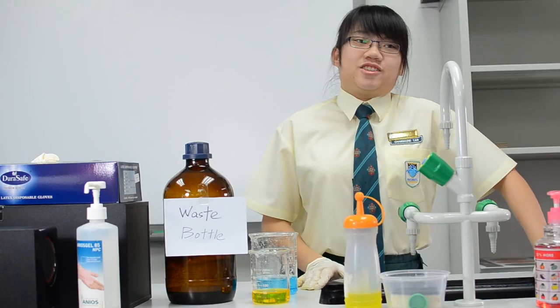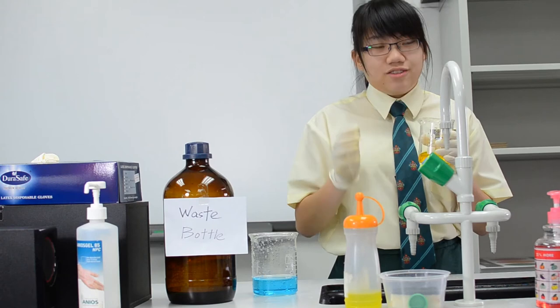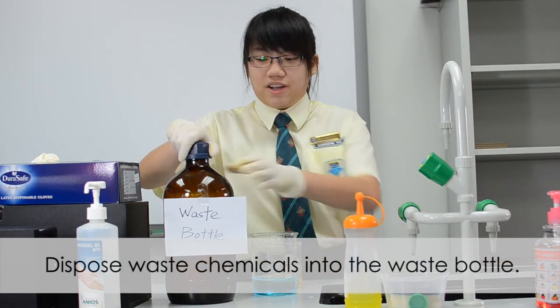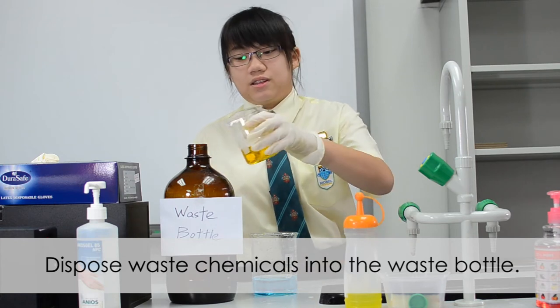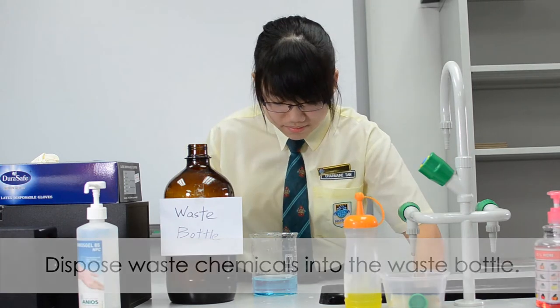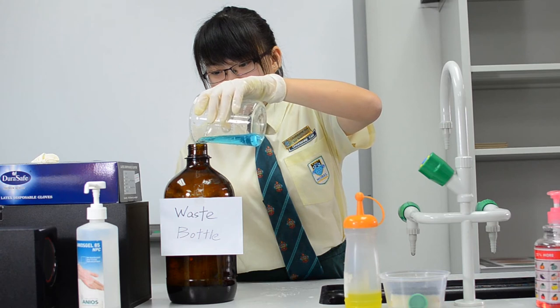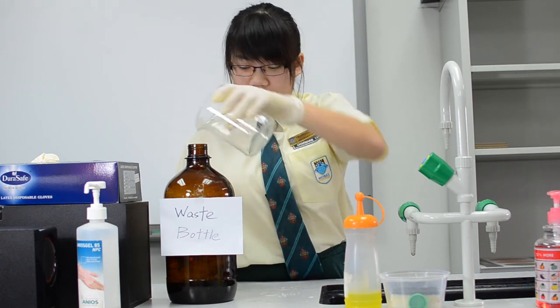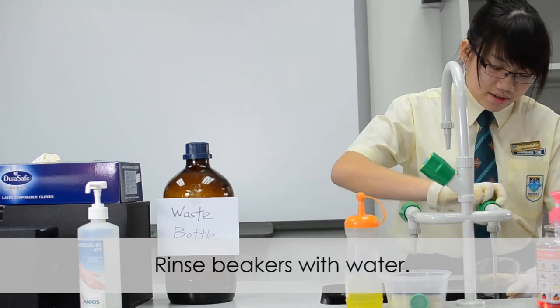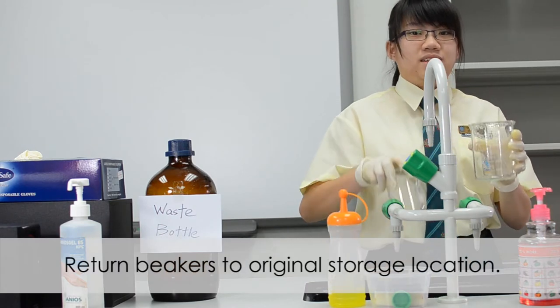Today I'm going to show you how to clean your chemical waste products. First, please remember: do not throw any waste products into the sink unless advised by your teacher. All waste products should go in your waste bottle. Open the waste bottle and pour in the chemical waste slowly. Then close it back and rinse your beakers with water, then return them back to their original position.